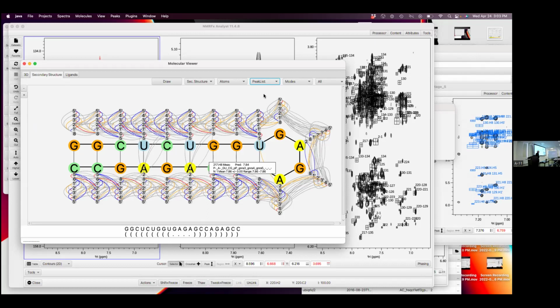So there should be a connection between the GH1 and UH3. We didn't see the carbon. So this is the carbon. These are proton connected. Yeah, you do see, for example, these peaks. I know that the Summers group says these are very characteristic peaks from the A across, to see these long range ones that show up in distinctive areas.